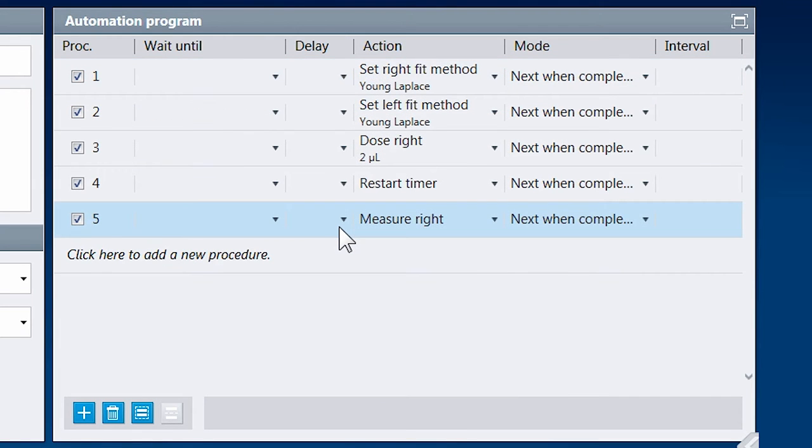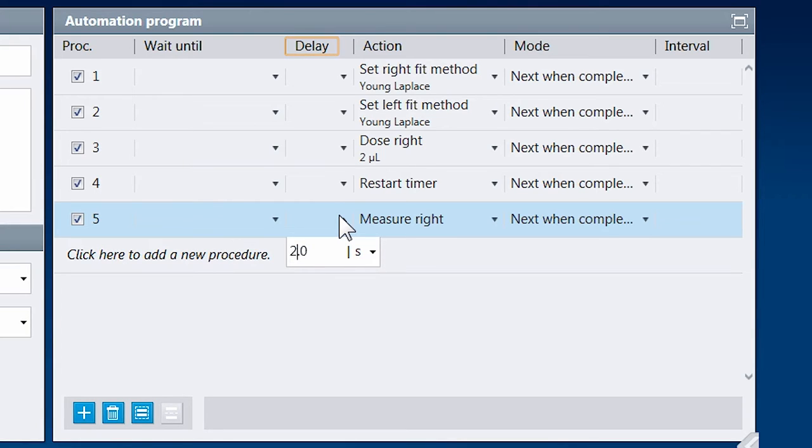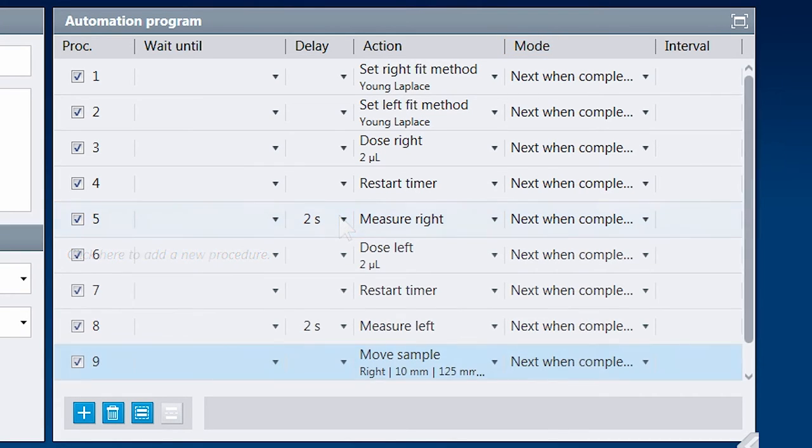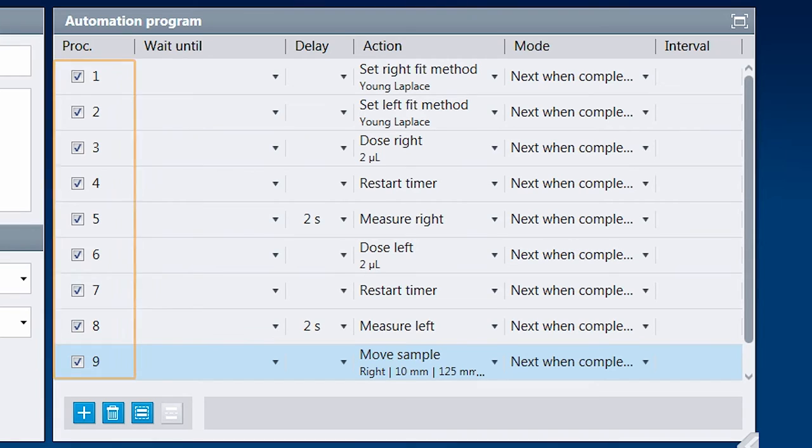And with the mode parameter, add repetitions of actions, parallel executions, or stop conditions. Let's skip ahead again. Our measurement now consists of several procedures. If we want to repeat a part of the automation program, we select these procedures and turn them into a group.